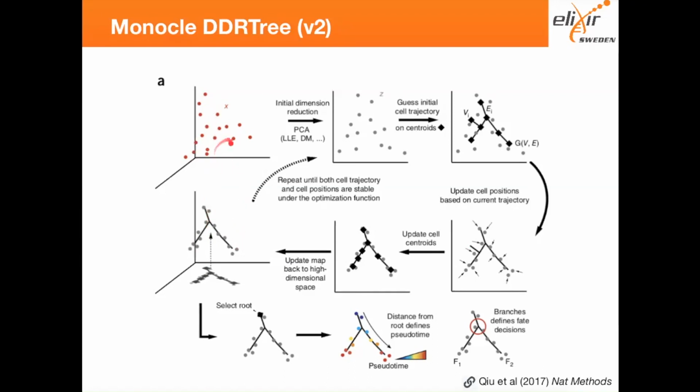If it doesn't match very well, you need to reiterate over this several times until what you have reconstructed matches your original data, which is similar to what I talked about when mentioning TSNE or UMAP. You iterate so that the dimensionality reduction method or the embedding space closely reflects what you have in the original data.